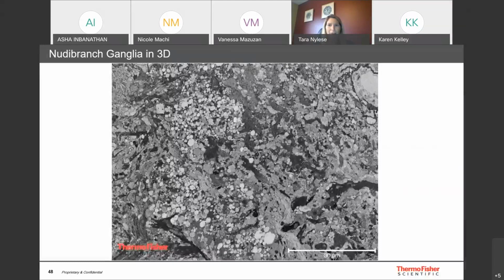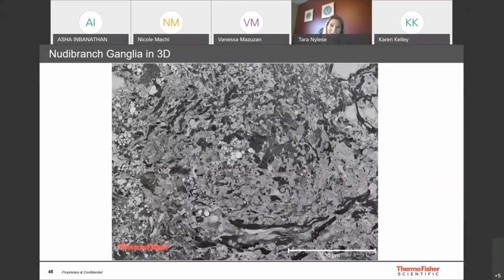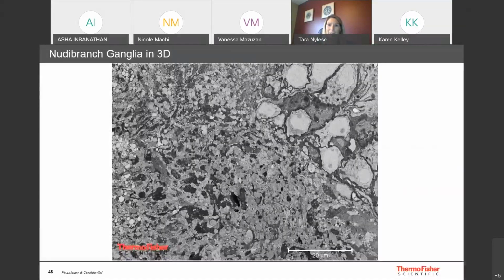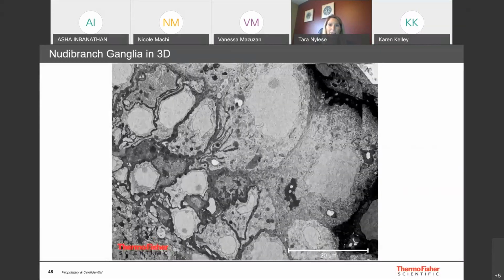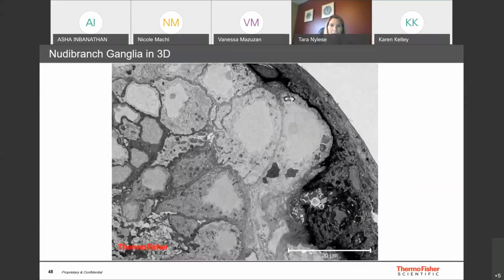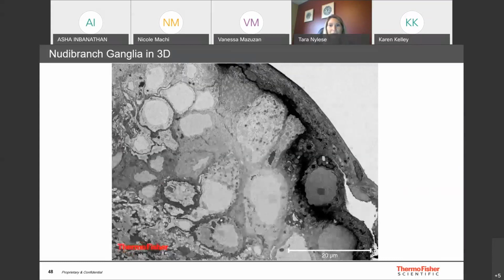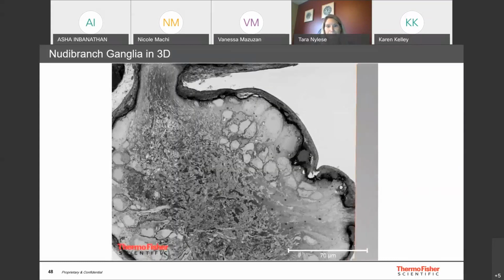And what's notable here is in the center, there's a distinct lack of cell bodies. So sort of dense material, but not very many cell bodies. And then the collection area and the region of interest, zooming in on the movie file that was created, now looks at some of these vesicles closer to the outer membrane.